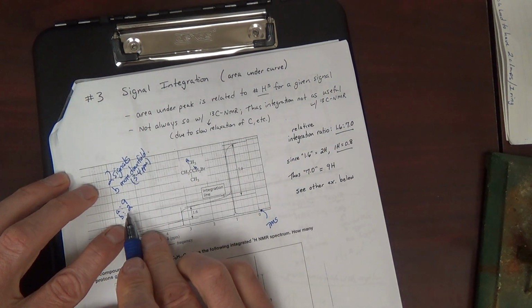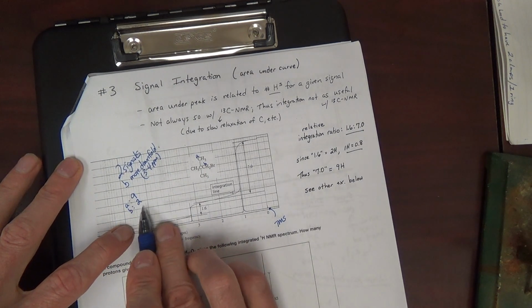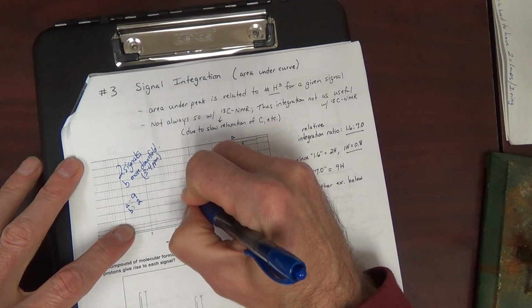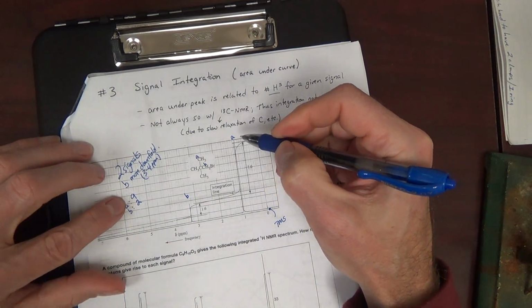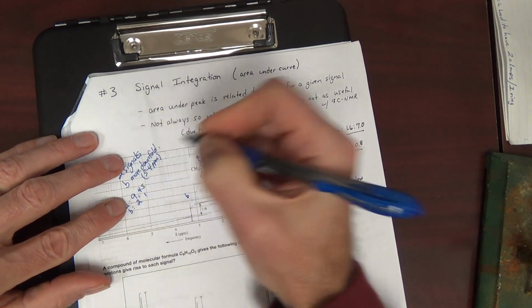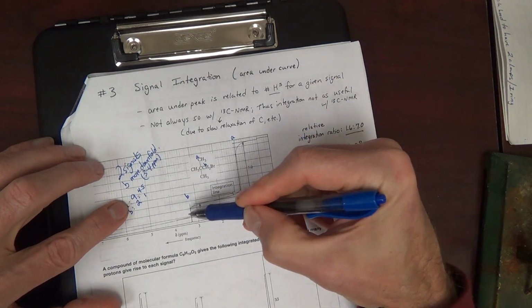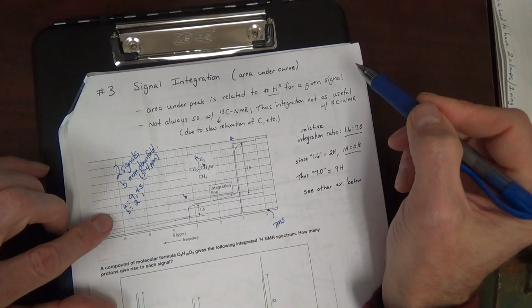We should expect that the intensity of these signals is in a 9:2 ratio. Now this is A and this is B. We can take this down to 4.5 to 1, right? This signal should be 4.5 times more intense than that signal, because the signal correlates with the number of hydrogens.